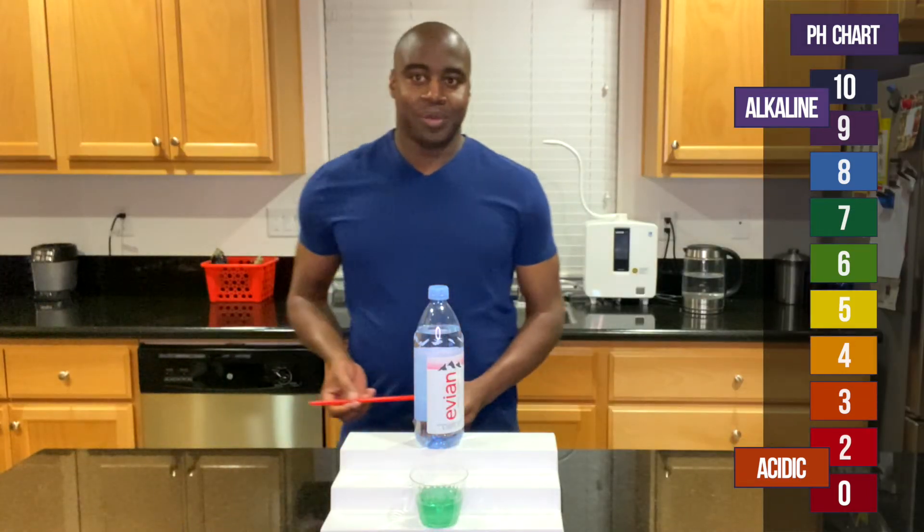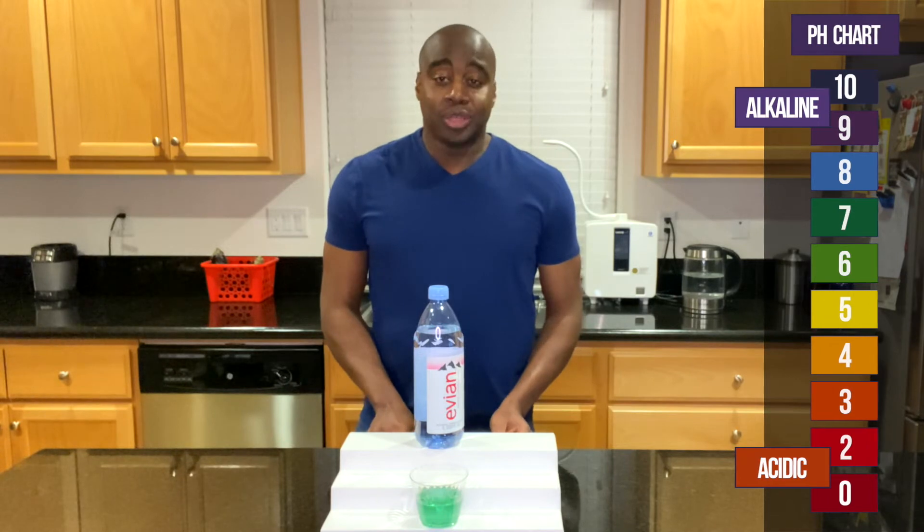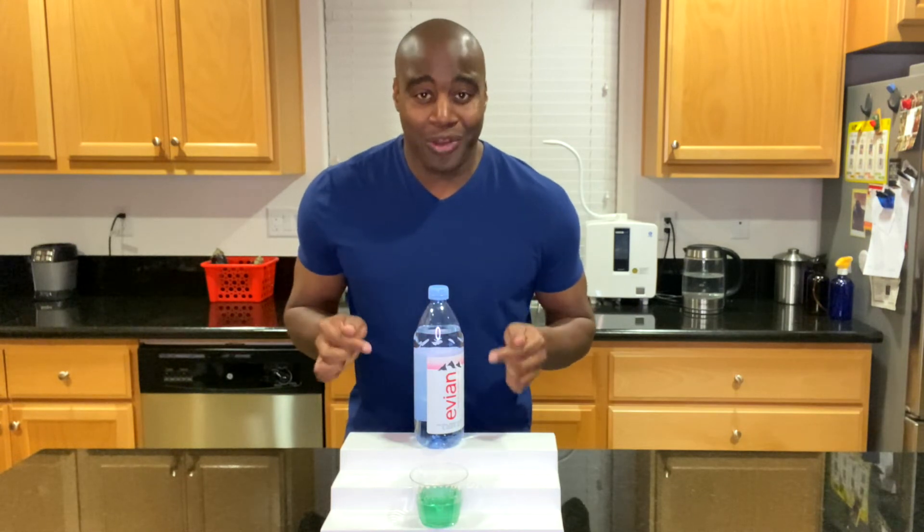All right, doesn't look like it really changed much. You tell me in the comments. In my opinion, it stays the same, but there's more to this water than meets the eye.